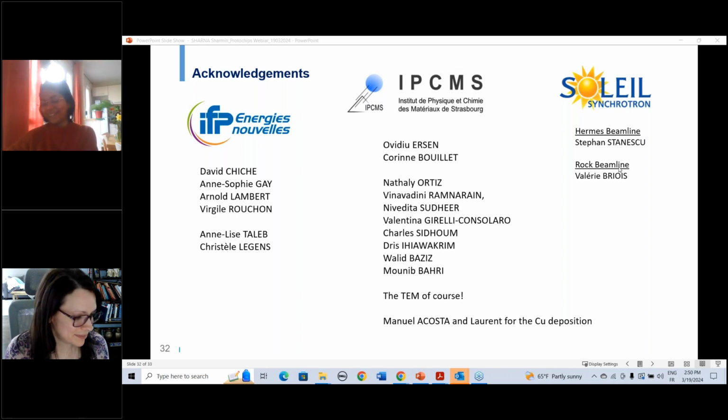Yes, I think so. If we change the amount of oxygen, let's say going from 50% to 100% oxygen, it would definitely change the kinetics of the reaction. That's something I mentioned, that if you do your experiment at lower pressure, the observation would be very different. So yes, I would expect the kinetics to be changed, and in some instances, if the pressure is too high or too low, the mechanism would be different. Yes, that makes a lot of sense.